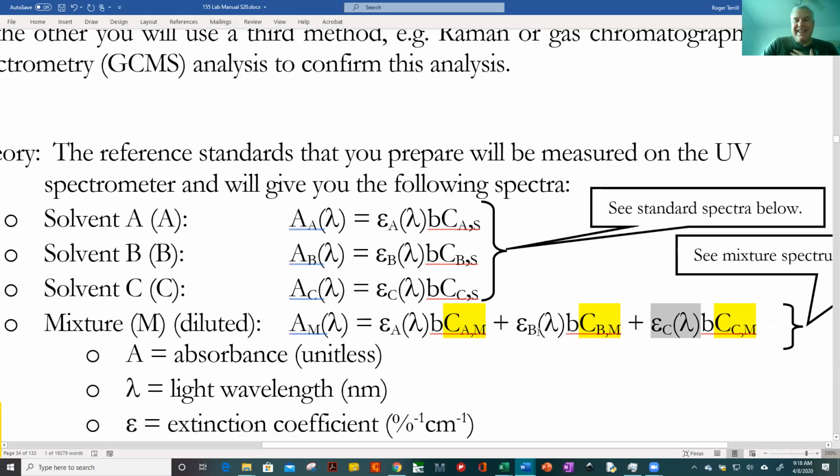Right. So basically, we have these three components and we can get the concentration of acetone by using a wavelength where these extinctions are 0. And so we got exactly 1% for the concentration of acetone.